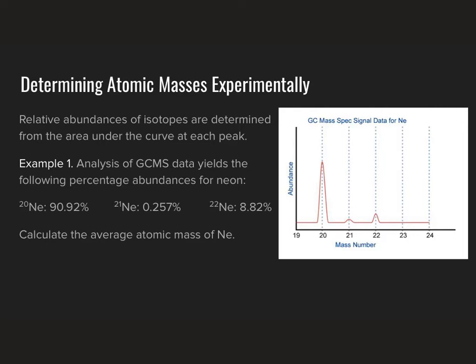And you'll notice that on that readout graph, we end up with 3 peaks along the graph, corresponding to mass numbers of 20, 21, and 22. So remember, this is all neon, so all of these atoms have the same atomic number, which really means that what we're seeing here is differences in terms of the isotopes that this mass spectrometer is picking up for neon that have different numbers of neutrons.